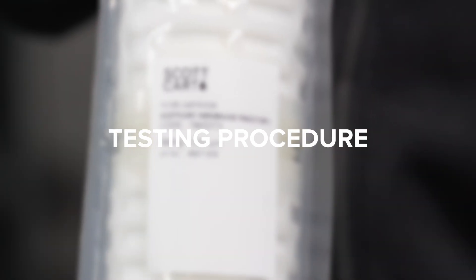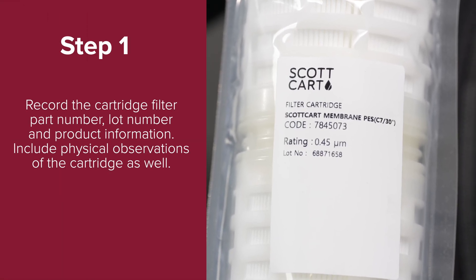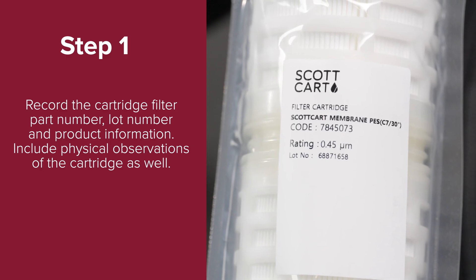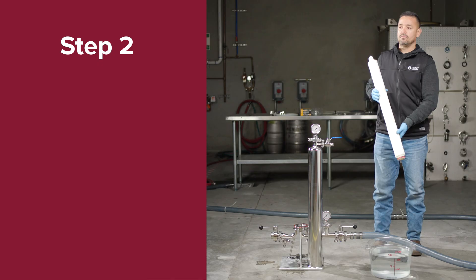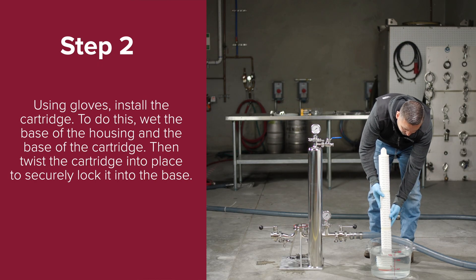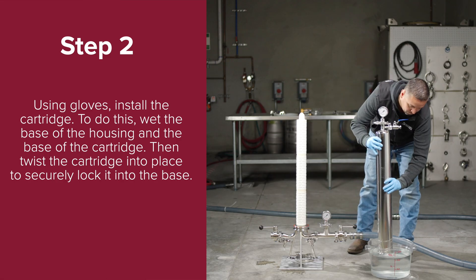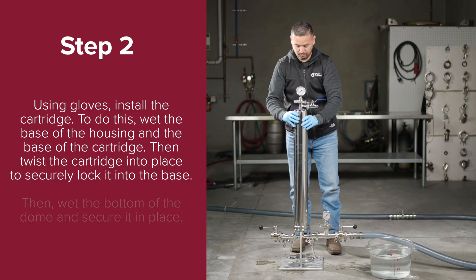Now we'll begin the procedure. Step one: record the cartridge filter part number, lot number, and product information. Include physical observations of the cartridge as well. Step two: using gloves, install the cartridge in the housing. Wet the base of the housing and the base of the cartridge, then twist the cartridge into place to securely lock it into the base.